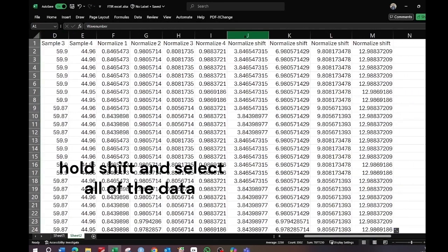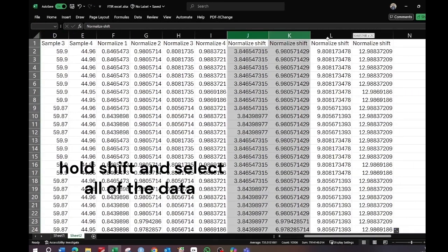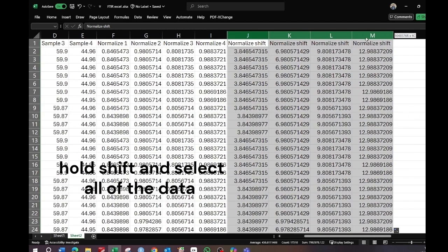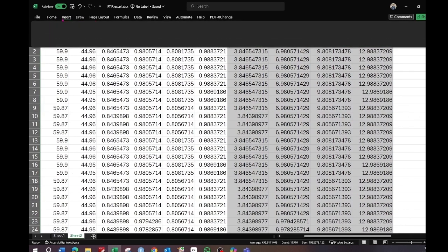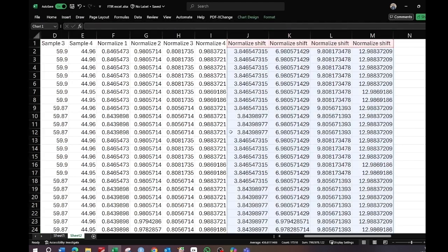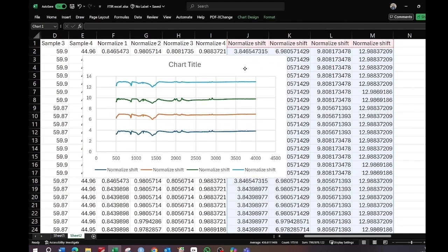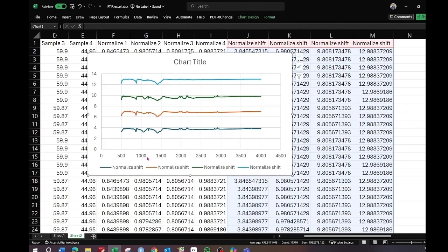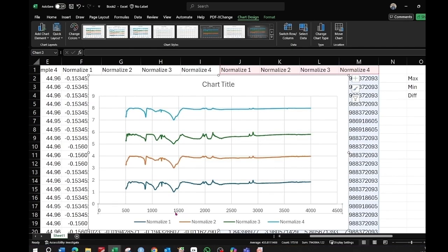Select the wave number column, then hold Shift and select all the shifted data columns. Go to the Insert button and select Chart. In this way your data will be plotted with the shifts applied.